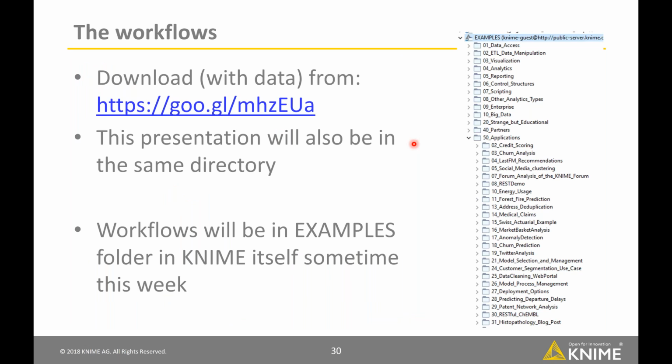Okay, cool. Do we have any more questions? No, you've got thanks from both the people who asked the questions. So do you want to go on and talk about some RDKit for a bit? Sure.